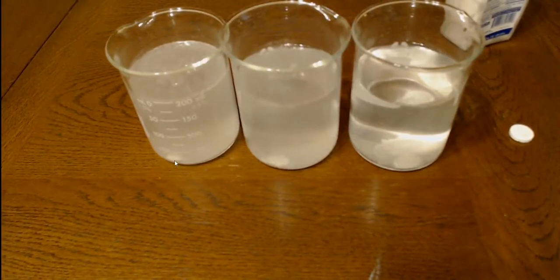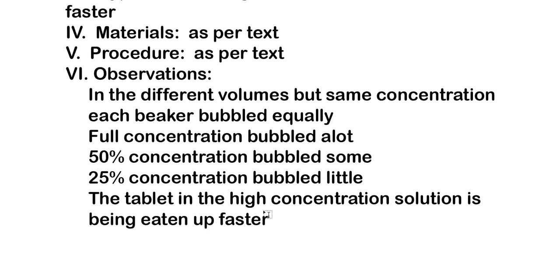Okay, it's dissolving away to nothing here pretty quickly. This one's kind of just falling apart a little bit from being in the liquid, but it's not being dissolved as it's making piles. This one a little bit too. So, okay, let's finish up our lab here. Let's go back to our lab.